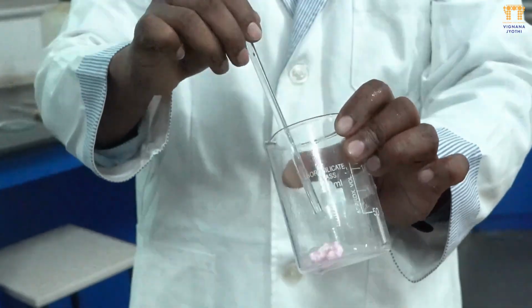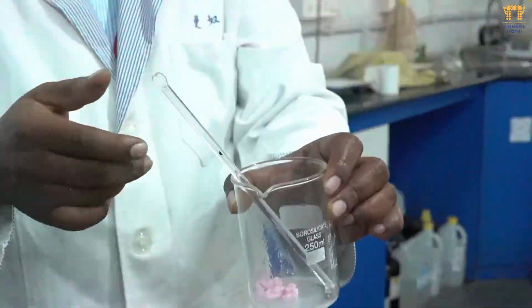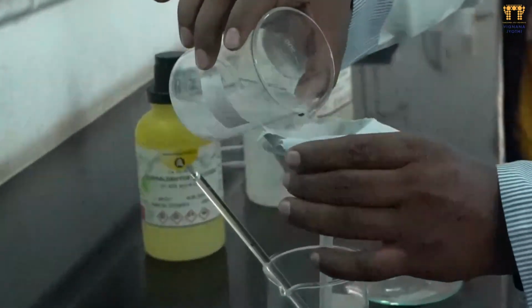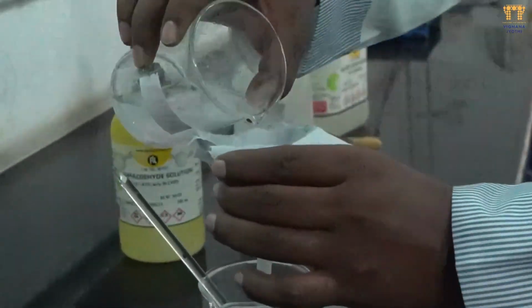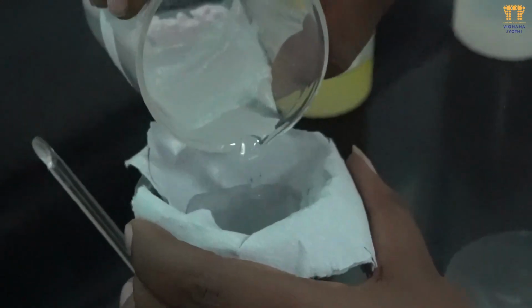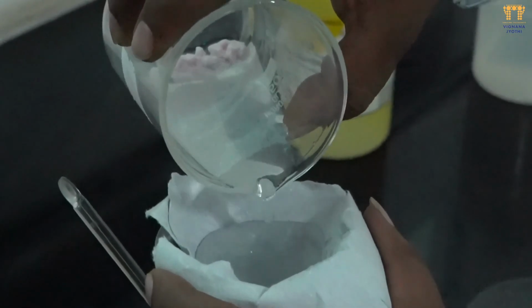Then finally you will get your bakelite polymer. So after the Novolac polymer, the linear polymer, it will become bakelite.